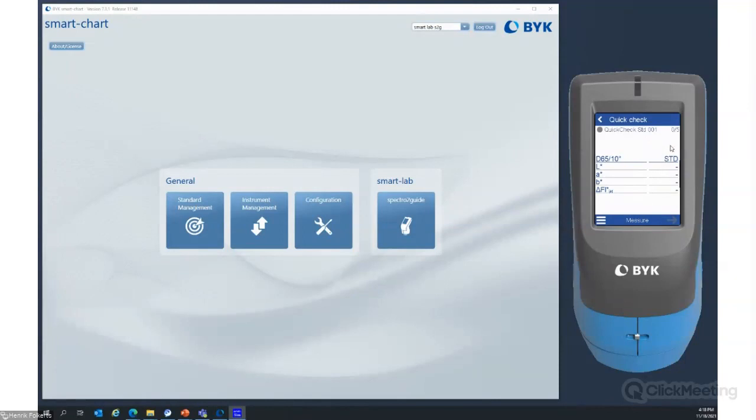You see my setup is average out of 5, because it's always good to do averaging on a sample. So 5 different spots on the sample. And now I can measure very quickly by clicking here or touching here on the screen. I say measure 1, 2, 3, 4, 5. You see the numbers. So this simulation creates random numbers. I click on forward, and now it's waiting for the sample measurement.